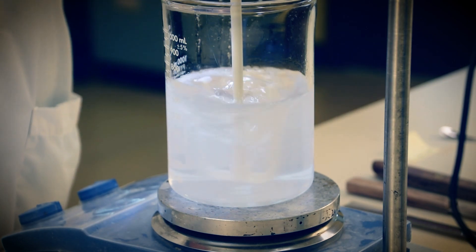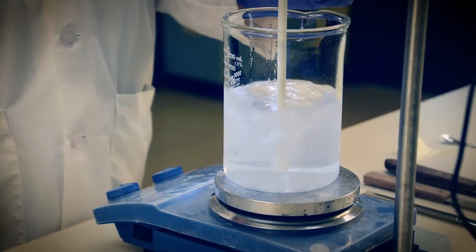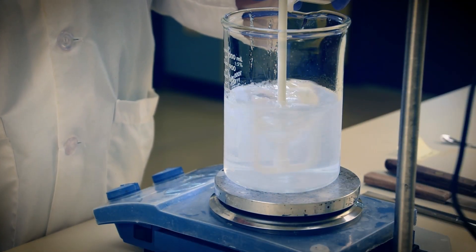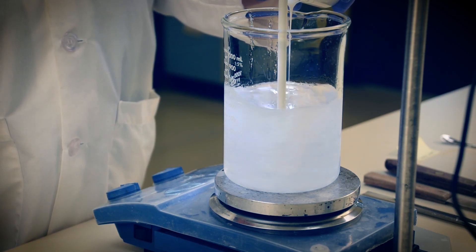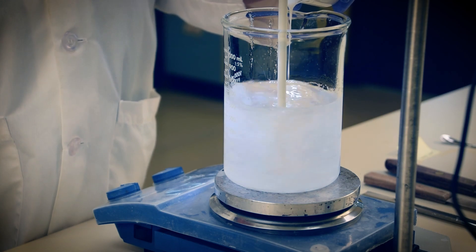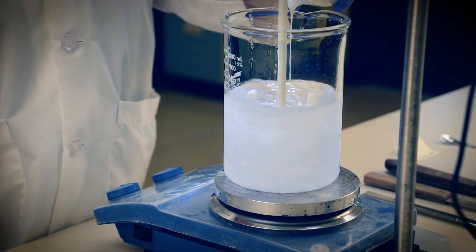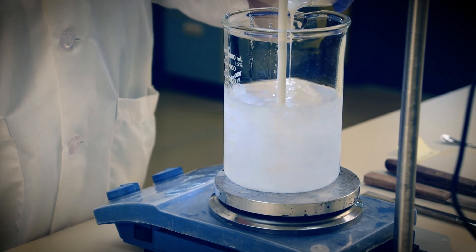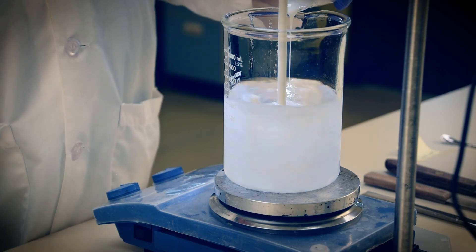Now we have a solution, but not yet a serum. Time to add Rapigel EZ-1. We add a measured amount of Rapigel EZ-1 — 4%. The presence of weak electrolytes such as hydroxy acids will impact final viscosity somewhat. We use just enough Rapigel EZ-1 to affect a flowing state of serum having viscosity in the range of 5,000 to 8,000 centipoise. This gel will then dispense easily, spread easily, and will not run on the eyes, mouth, or nose on application.